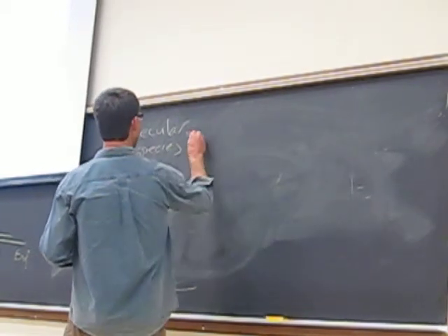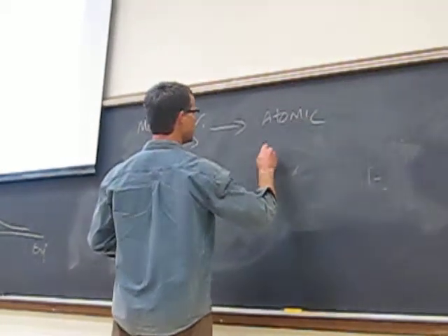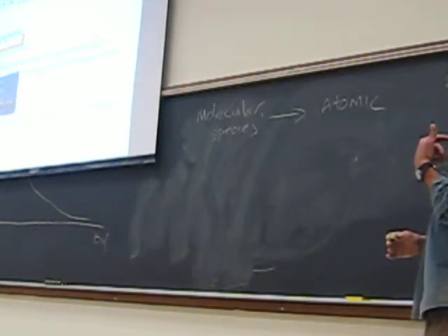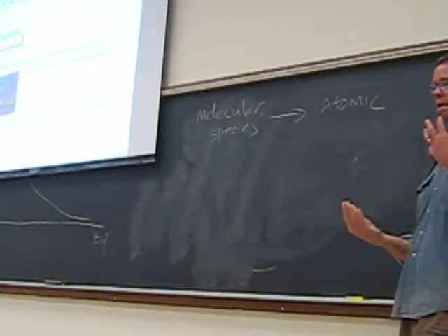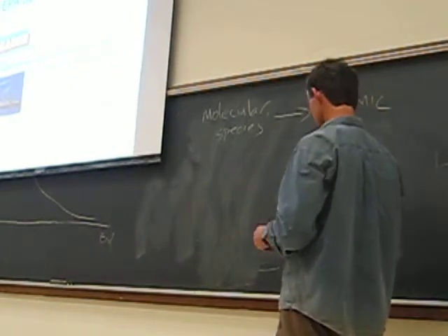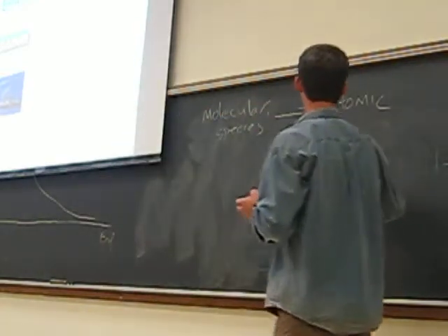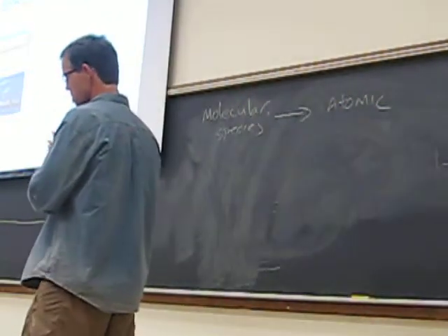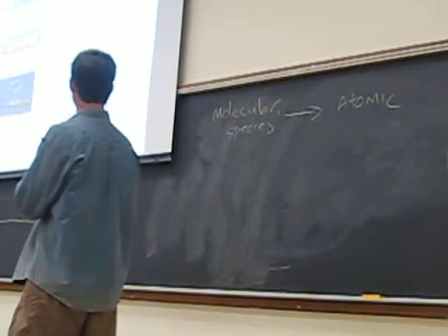And so we're moving from that now to start talking about measurement methods that are based on measuring things at the atomic level. Molecular absorption spectroscopy relies upon a very different set of principles, some very similar but some different, than atomic absorption spectroscopy. And I want to start this because it has so many applications in the real world in these atomic spectroscopy measurement methods that I think are very important.